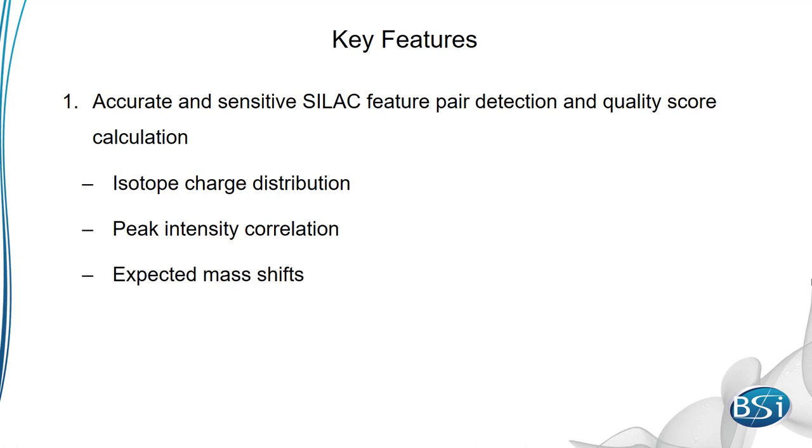These details are also used to calculate a quality score, allowing you to make sure only good quality labeled peptides are quantified.